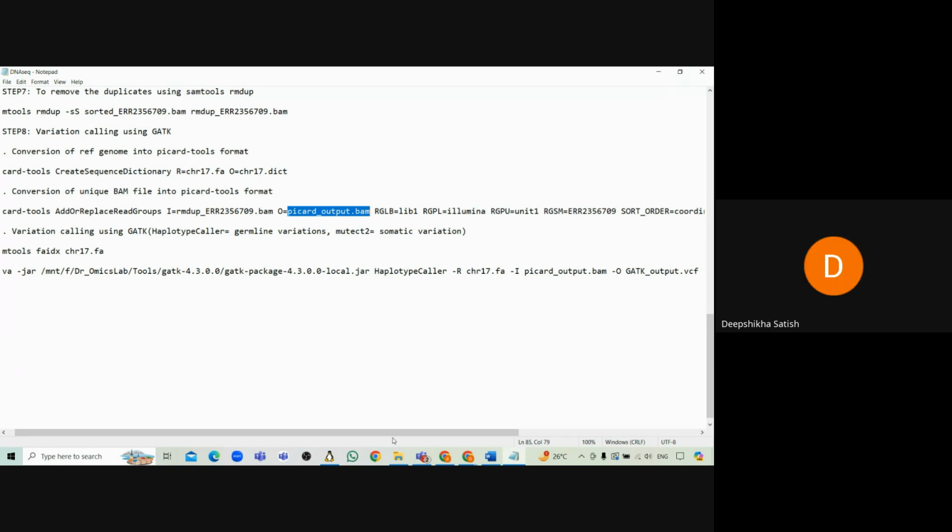Okay. Now, I want to explain this haplotype caller. Basically, the haplotype caller in the GATK is used for variation calling and identifies SNPs, single nucleotide polymorphisms, and small insertions and deletions, meaning indels. But how does it work? Basically, it works in 6 steps.